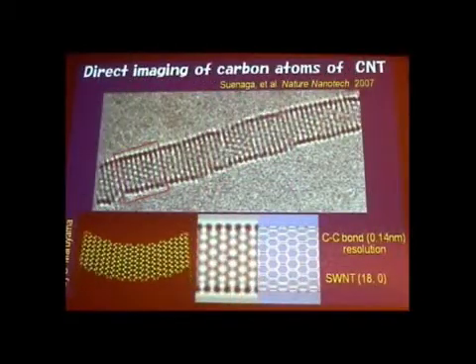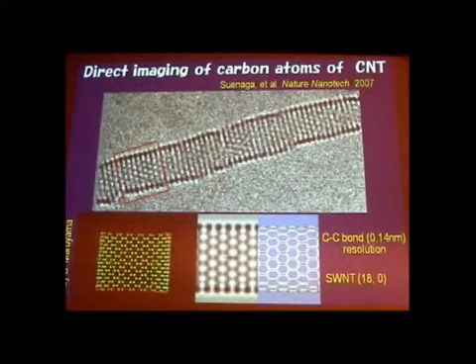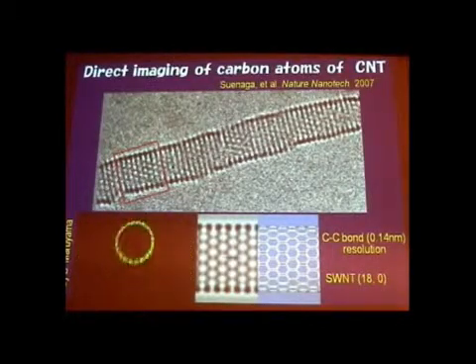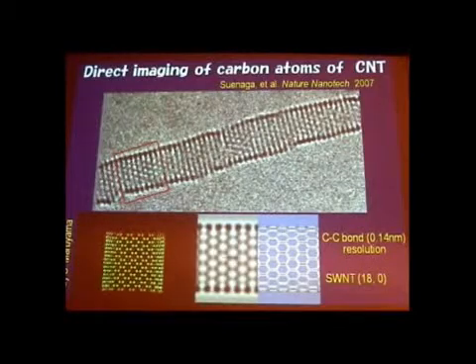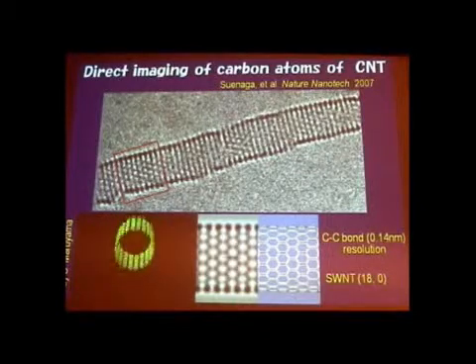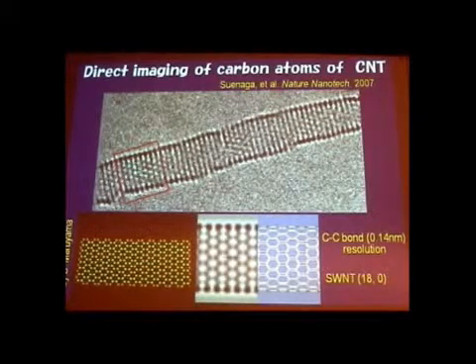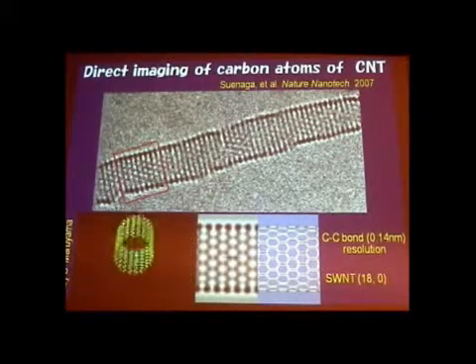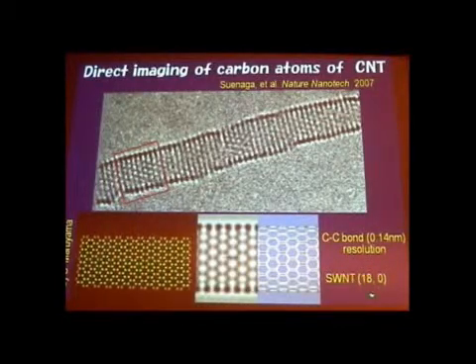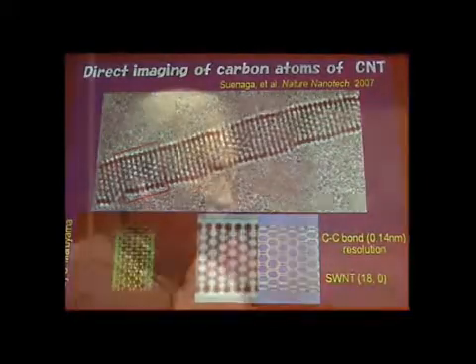Right now, they are using the latest microscopes, and you can get detailed information. This one, the single carbon nanotube, and the single images give us all the information about the carbon nanotube, because we are almost able to see individual carbon atoms. So immediately we can tell this one is an 18 tube. So this is a very powerful technique.